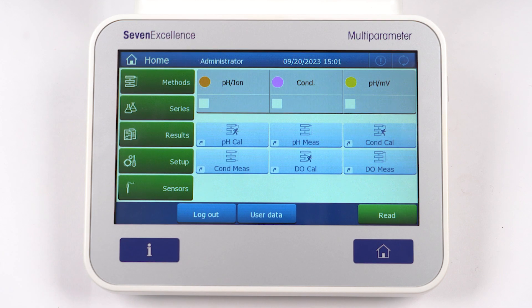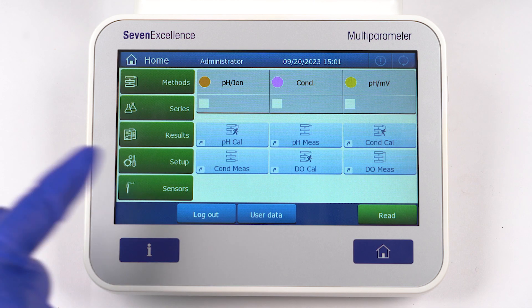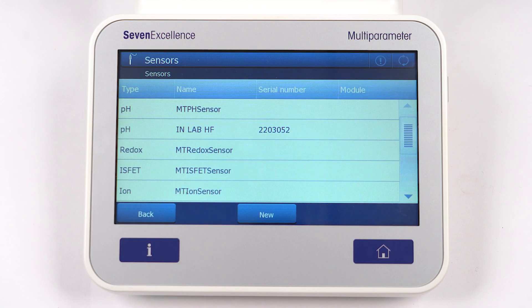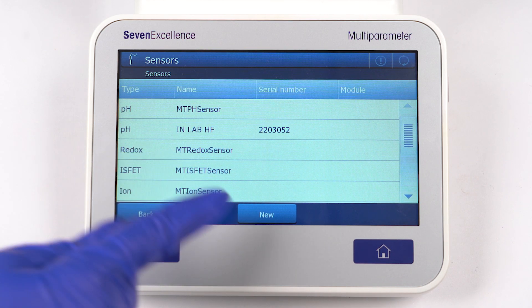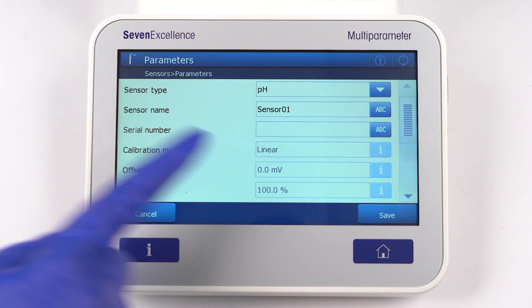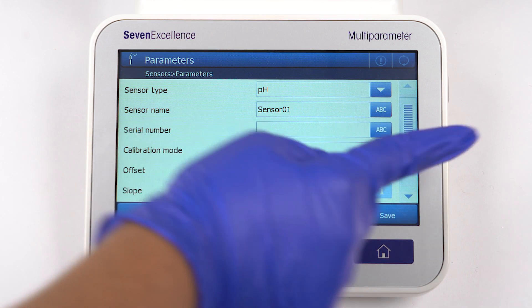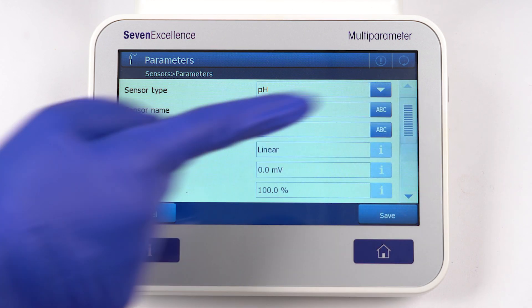Last but not least, there's the Sensors menu. Here, you'll find the sensors list that is saved in the instrument's memory, as well as all the ISM sensors that are currently connected. And if you need to add new sensors, this is where you'll do it.